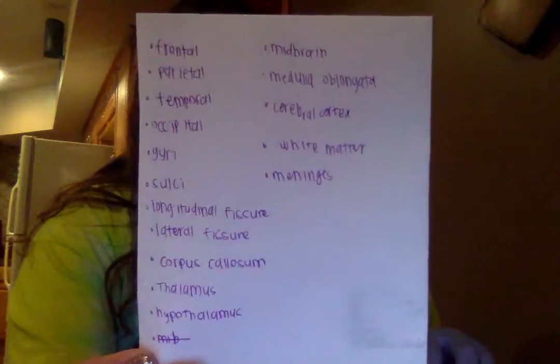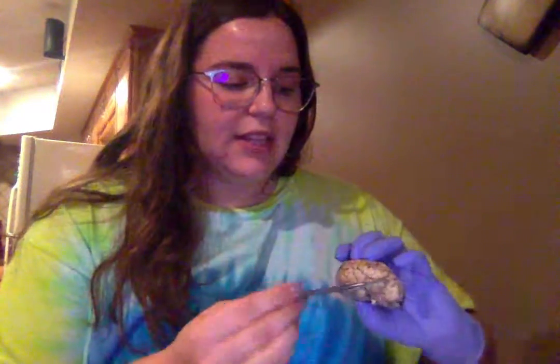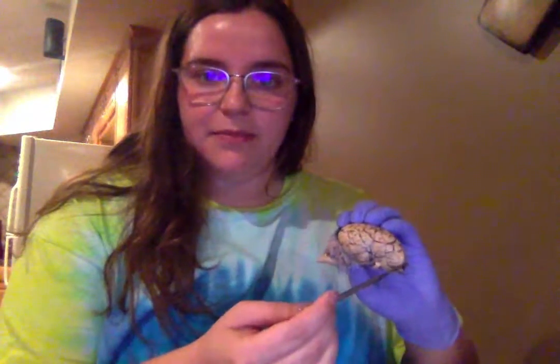My name is Monica Marasco, and today I will be doing the video on the sheep brain dissection and the sheep brain anatomy. Here I have a list of all of the structures that I will be listing on my brain.